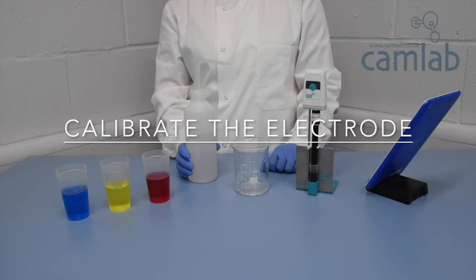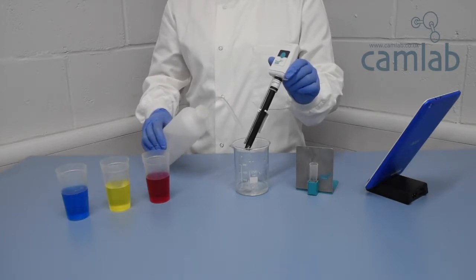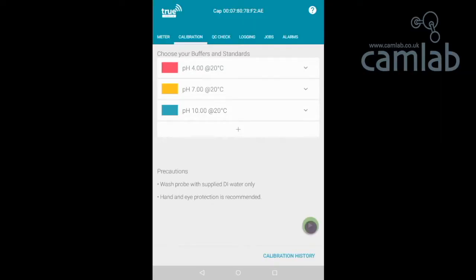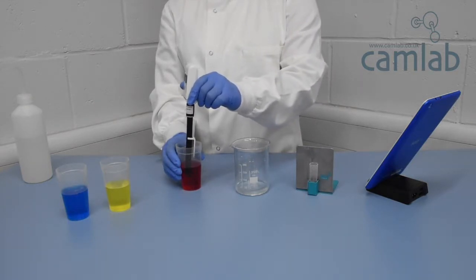To calibrate the electrode, pour a small amount of each buffer into separate beakers and rinse your electrode with deionized water. Then touch the green play icon to begin. Place the electrode in the buffer, stir gently, and then stop.